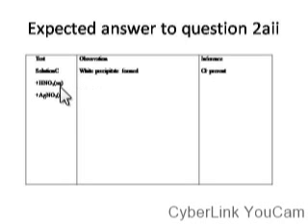When you add trioxonitrate(V) acid, the white precipitate remains, and that will tell us that it is chloride ion. Please take note of that. So the silver trioxonitrate(V) solution can come before the trioxonitrate(V) acid. So whichever one comes first, white precipitate will be observed.